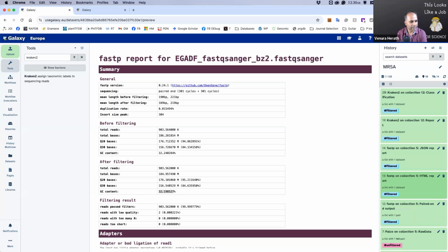Randika, have you started Kraken 2? Yes, sir. Got the result. It is about a 6-column table. Okay, sounds good. So we will wait a little bit because for some of your colleagues, the program is still running. We'll wait probably a couple of minutes and then see the output.